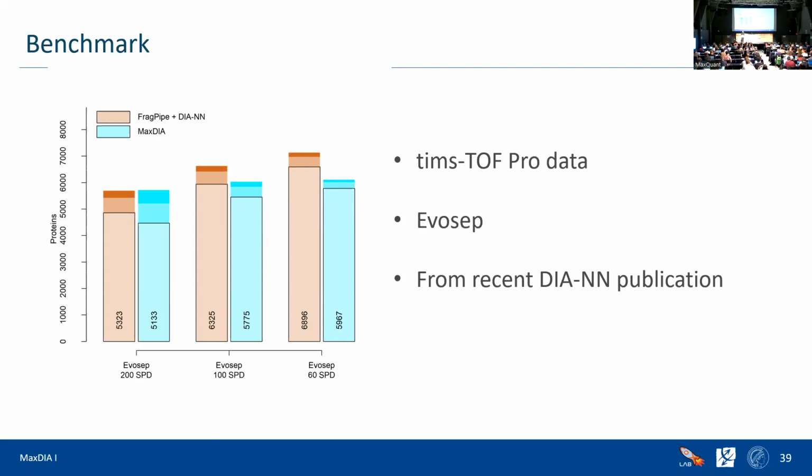The only thing it cannot really do is handle it if the retention order changes significantly. We cannot do that in the predicted library approach. But everything that has more or less the same order, just with a slightly different exact path, will be properly aligned.